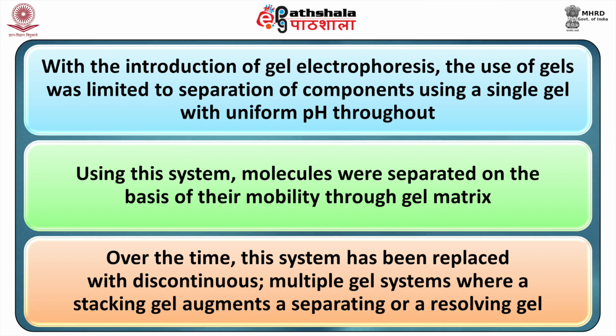Using this system, molecules were separated on the basis of their mobility through gel matrix. Over time, this system has been replaced with discontinuous multiple gel systems where a stacking gel augments a separating or a resolving gel. These gels have different concentrations of the same support media and pH. The pH of stacking gel is 1 to 2 units lower in comparison to resolving gel. This difference in concentration and pH determines how the molecules separate when they enter the separating gel.